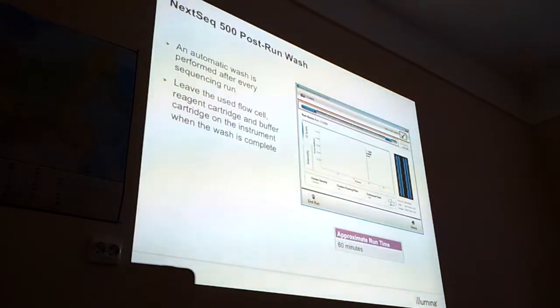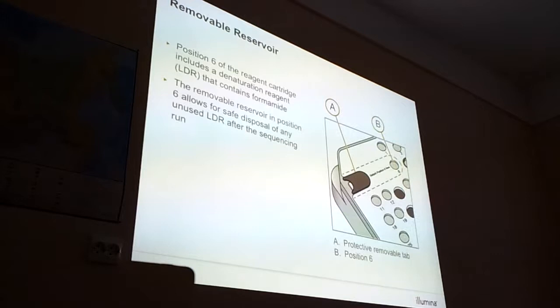But then should we replace the flow cell with a wash flow cell? Yes, then you should replace it. And I will show this in detail. Okay. So this post-run wash takes 1 hour, but it happens immediately after the run.